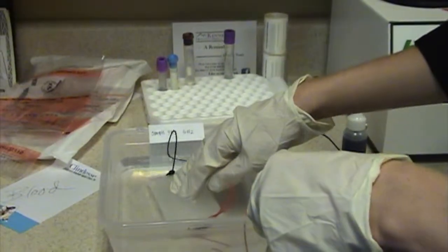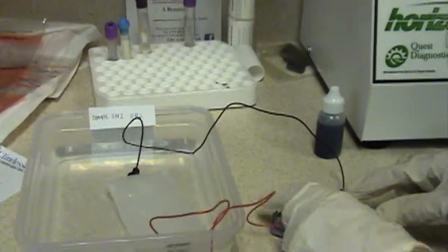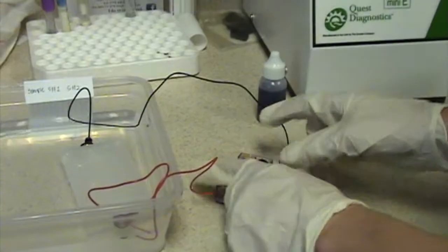And I will now turn on the battery. We will now have to wait a few hours. Because this is such a long process, I will be showing you a simulation of what the DNA would look like going through the agar gel.